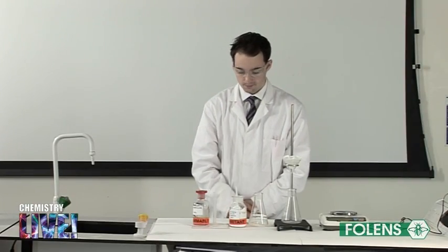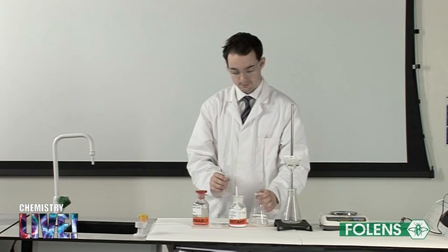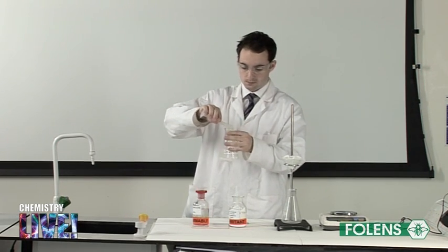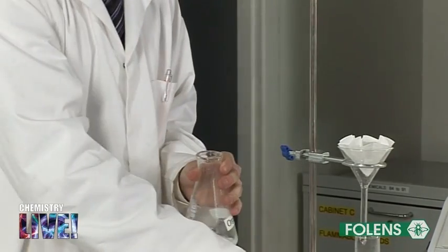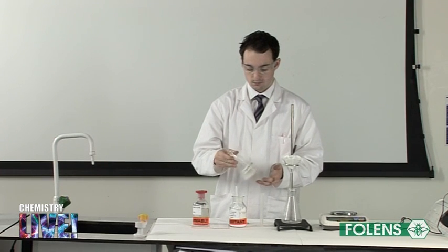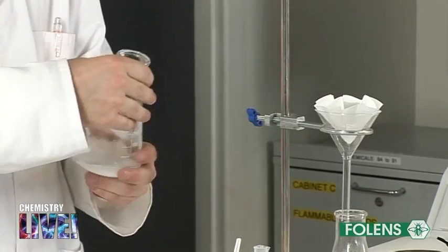Using 10 centimeters cubed of fresh cyclohexane solvent, wash out the conical flask containing the magnesium sulfate residue and traces of oil into the fluted filter paper. This washing with fresh cyclohexane removes any traces of oil that may be attached to the magnesium sulfate in the conical flask.